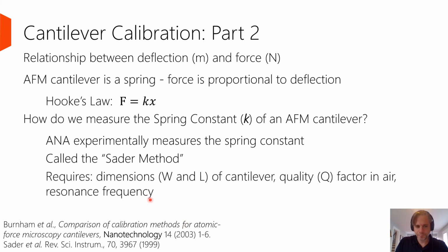To apply the Sader method, we need a couple of things. The first is we need to know the dimensions of the cantilever, both the width and the length. This we can just ask the manufacturer of the cantilever what they are, or we can measure them optically, etc.